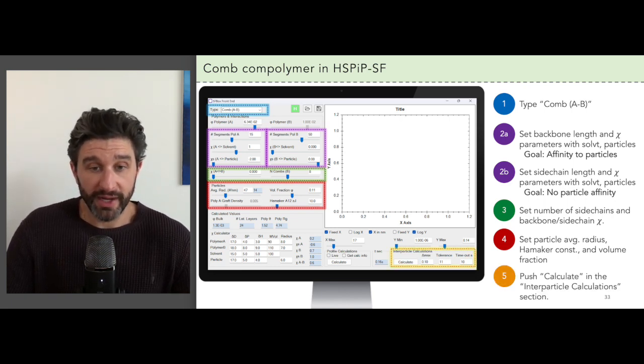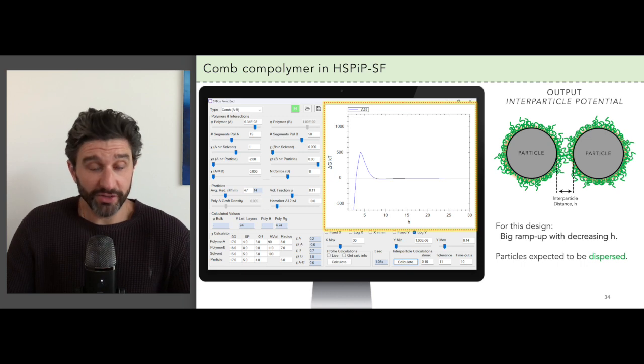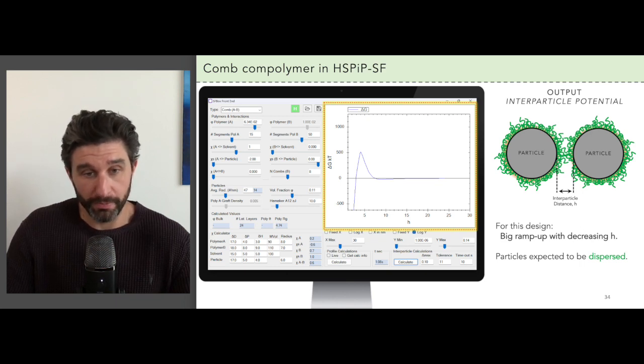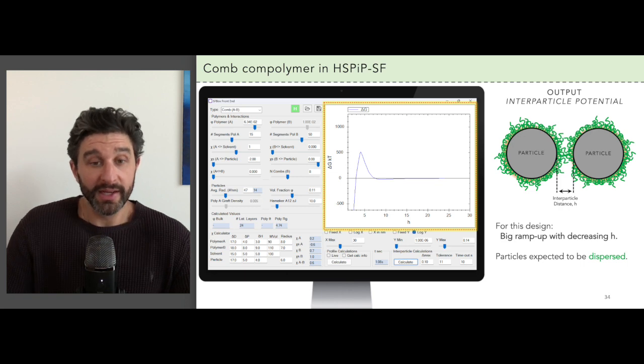With these all in place, we can go ahead and click the calculate button in the interparticle potential box. The output shown actually looks really characteristic of a good dispersant. As we covered in the last episode, we look for a characteristic hump in the interparticle potential, meaning that the polymers are doing their micropillow action.